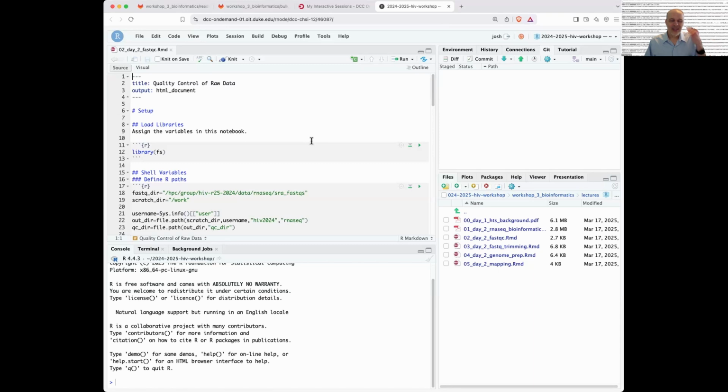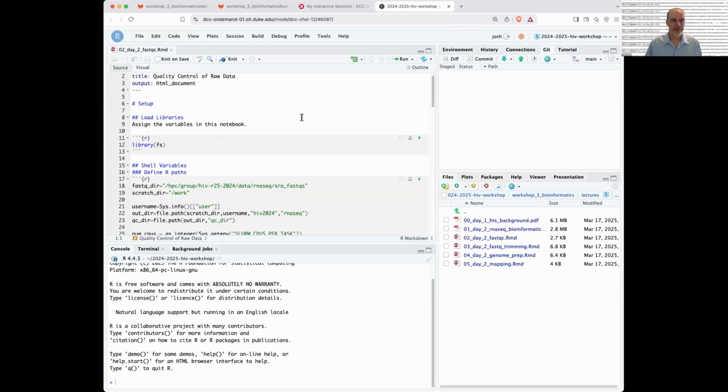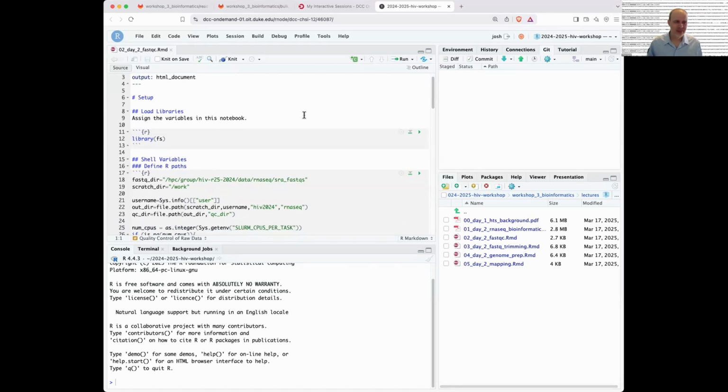So just because of time, we're just going to walk through and run chunks. Normally, when I have more time, I like to type things out. But like I said, I'm going slow today, and so I'm just going to try to quickly explain what's going on without getting into too much detail.